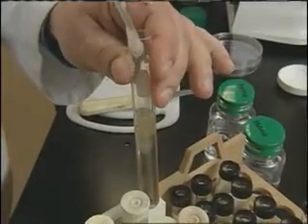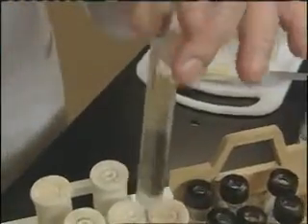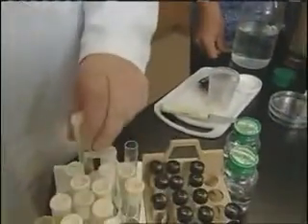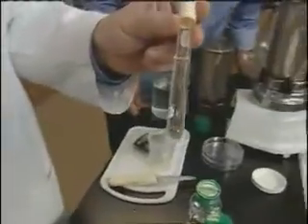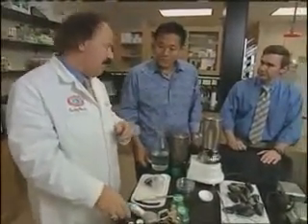And the incubator is warm, I assume? Yeah, around 95 degrees Fahrenheit, which is around 35 degrees centigrade. And after 24 hours, there'd be gas production. A negative tube with no bacteria would look like this. It would be perfectly clear. Perfectly clear. And you test not just mussels, obviously, you test all shellfish. Oysters, littlenecks, topnecks, fryers, steamers, all the mussels, all the shellfish that comes out.